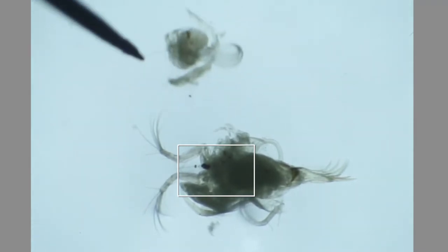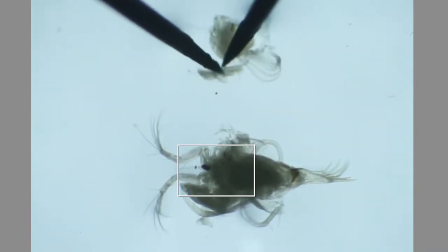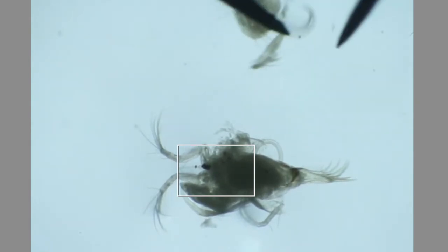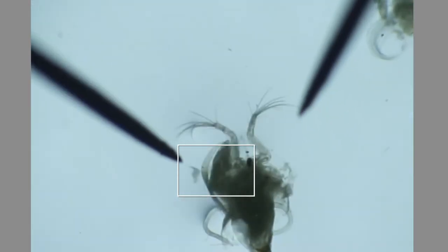Here is our second antenna, and with it actually came what looks like a mandible — it kind of got stuck to it. So those two are going to have to get separated out before I put on the cover slip.